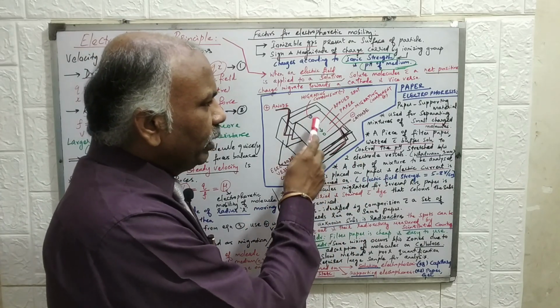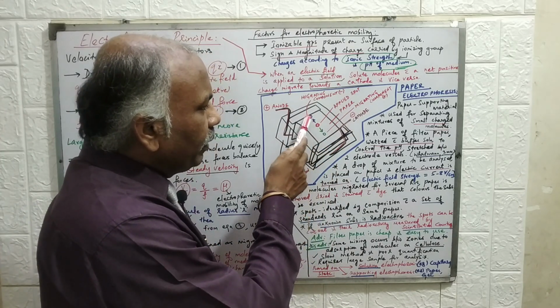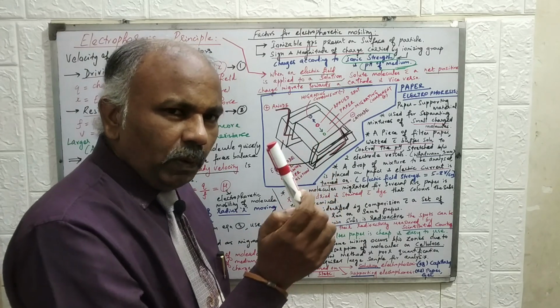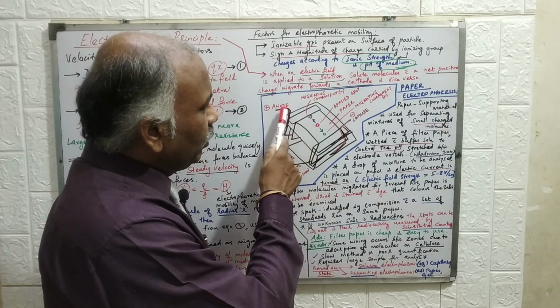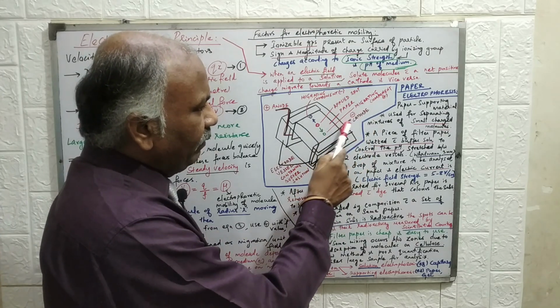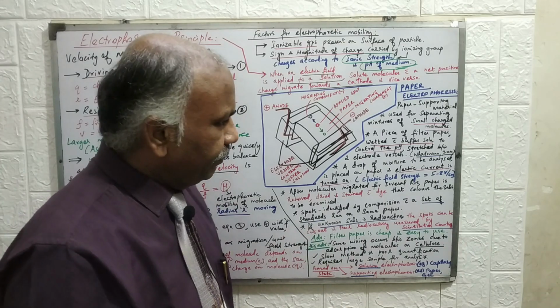When you switch the electric current on, the sample components get separated in two different directions. We apply the spot mixture in the center. If the migrating component is a negatively charged molecule, it will travel towards the anode, and if it is positively charged, it will travel towards the cathode. This is how the components get separated.